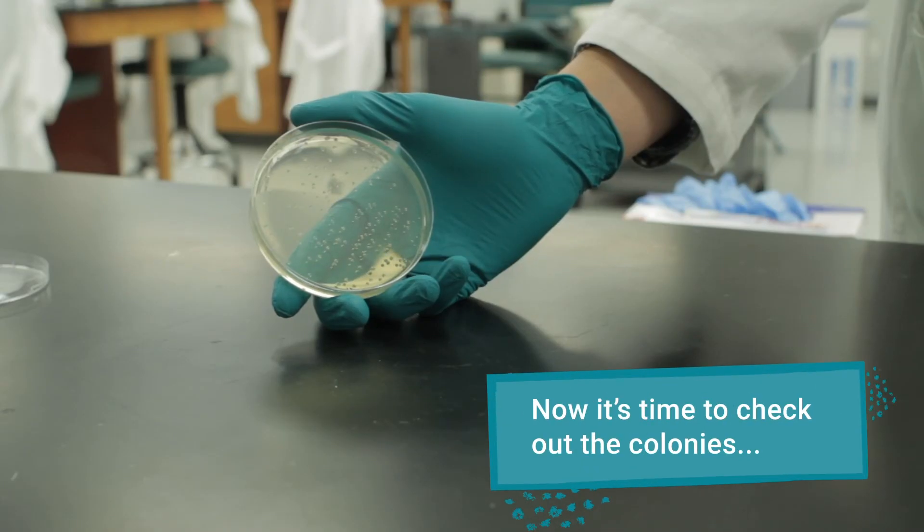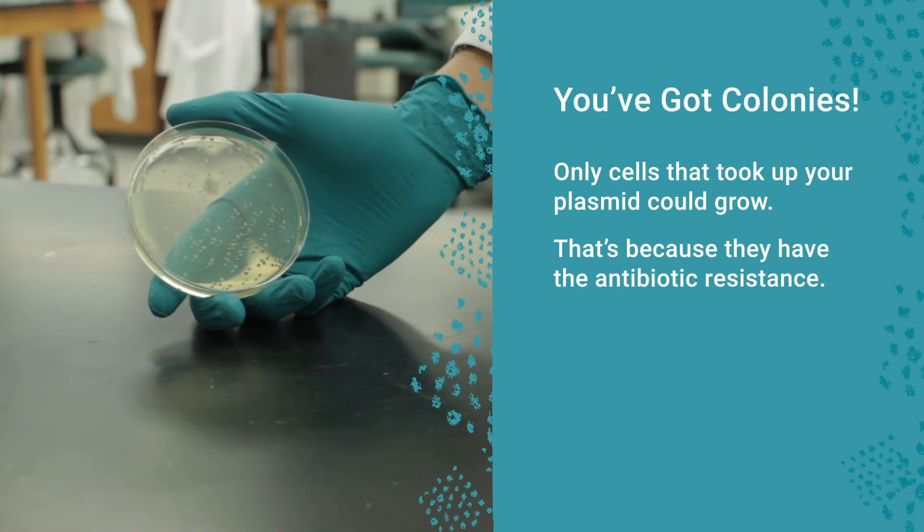Now, it's time to check out your colonies. Since the plates were treated with an antibiotic, the colonies most likely are made up of cells that took up your plasmid containing the resistance gene, otherwise they wouldn't have grown.